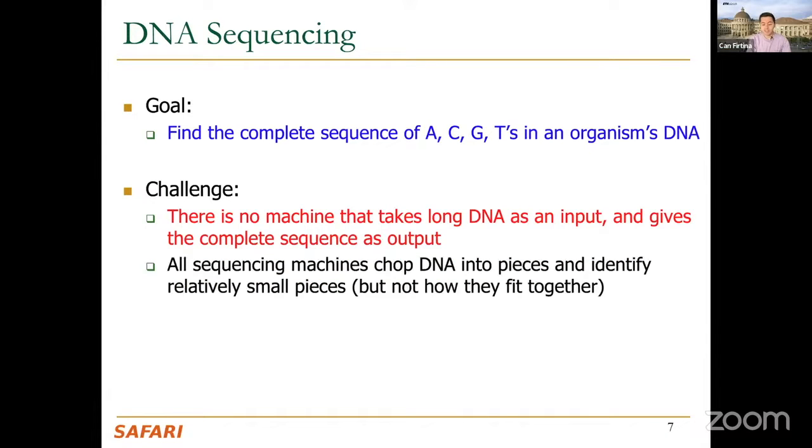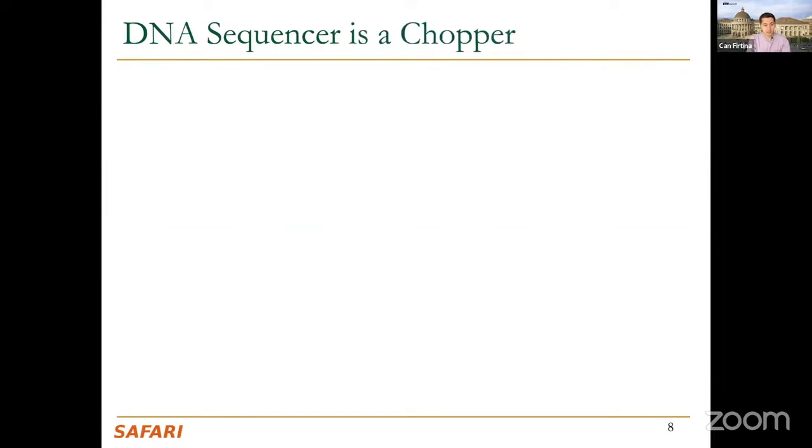So what we sequence is actually the chopped or fragmented pieces of DNA, and as an output, what we get is again the fragments of DNA, where we don't know where this DNA is sequenced from in the original genome. So we lack the order information and the position information after sequencing.